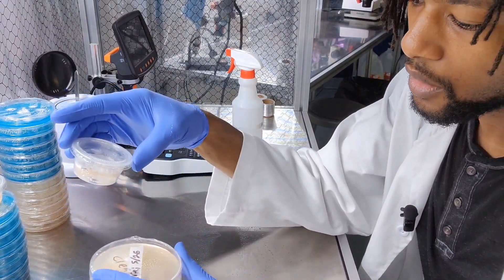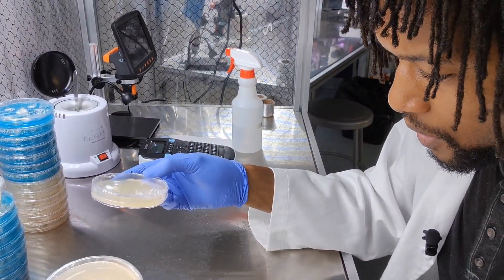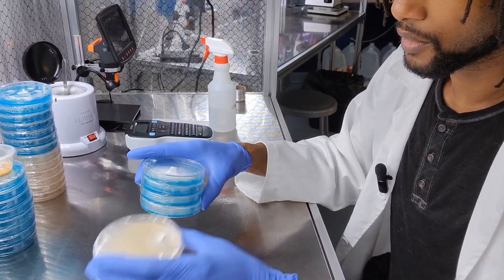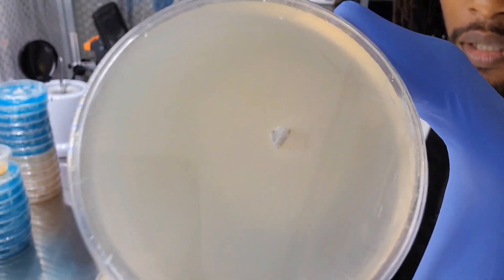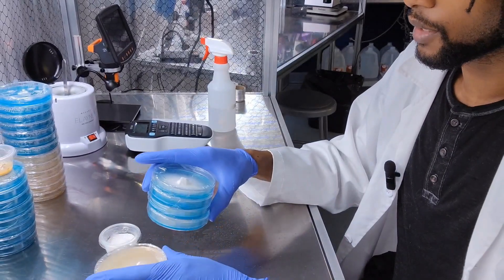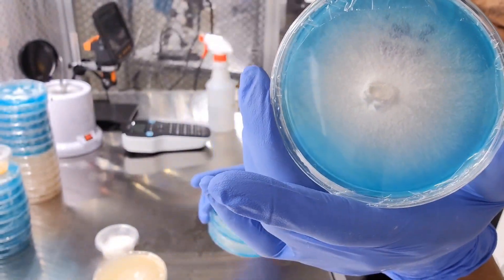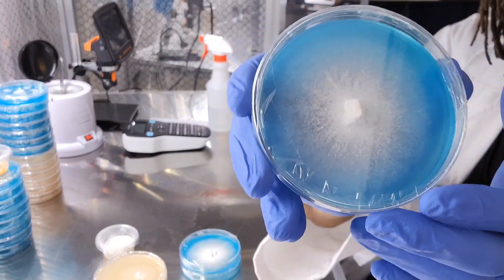Next up is what we call the sidewalk reishi. The mycelium in here is very, very thin. You can tell it all colonized pretty well, especially these plates. This is why we do different color plates — on these plates you can just barely see the mycelium coming out from that point, but it's so much more obvious on a blue plate. How incredible that is. All the white coming off of there — that's the mycelium we placed from the original plate.